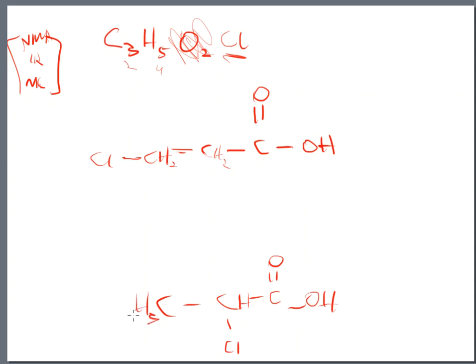So I've got 3 hydrogens on the end here versus 2 hydrogens on the end with the first way that I've drawn it. So these are 2 different structures that represent C3H5O2Cl. They kept it pretty simple. They didn't allow me to make major mistakes or play trial and error a lot, because I'm really restricted on what I can do here as far as the basic structures go.